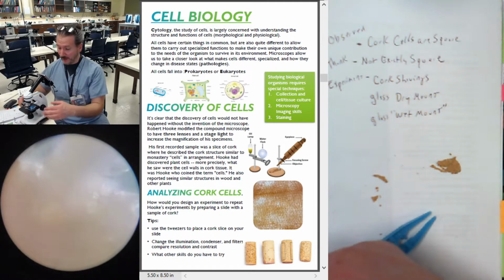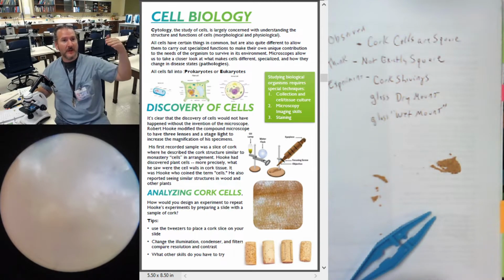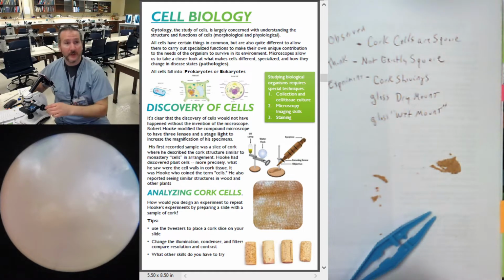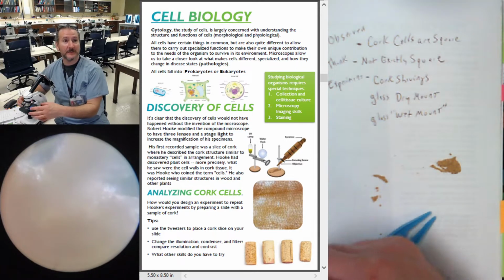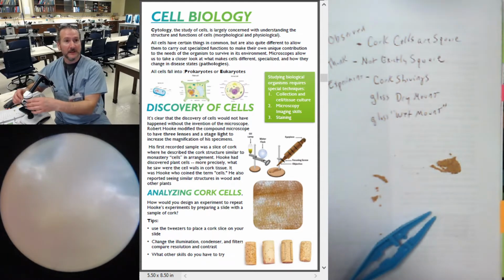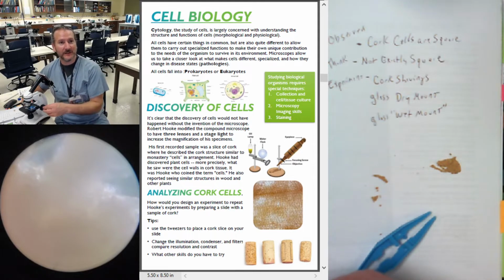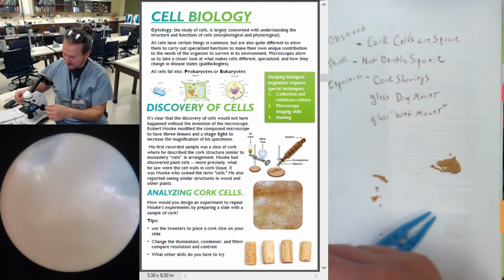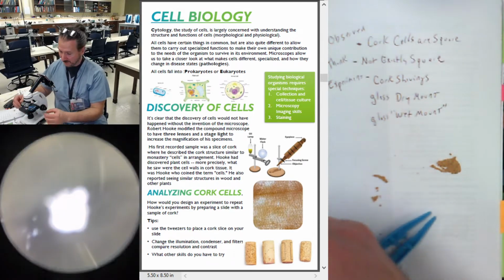But, so this is on dry. I would probably be a little bit more successful if I had some water in there, because remember, when the light goes through the water, it doesn't bend as much as it does through air. Remember the whole topic we did before, pools and fogs, right? The air and fog distorts it so much that it becomes very blurry. The water keeps it pretty precise. It just warps its perspective, so you still get a clear image. It looks twisted. All right, I'm not going to get this on the highest power, so let's go back.